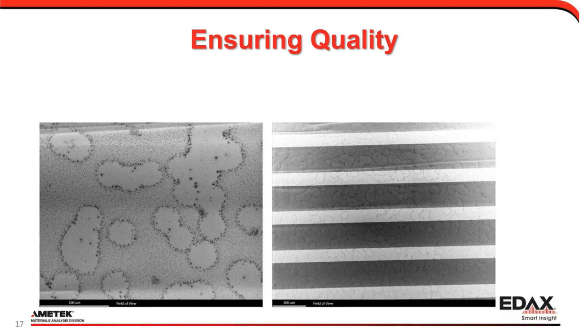And in this case, at low mag, you could see the bar arrangement for the detector window. And fortunately here, we're just looking at some oil contamination on the front of the detector that hasn't completely failed the detector. There's not a hole in it. So the good news here is something like this can be cleaned. The bad news is you want to avoid contaminating your detector, of course, because that will eventually break it down.